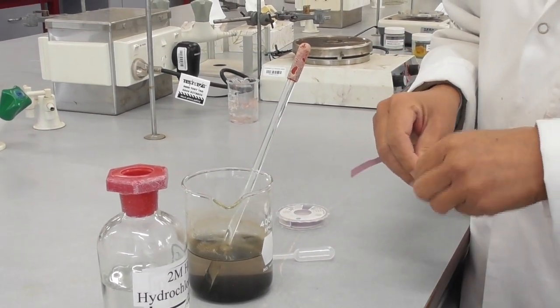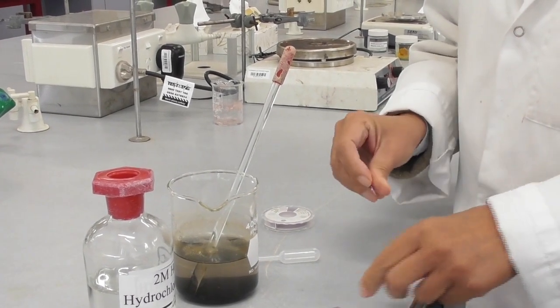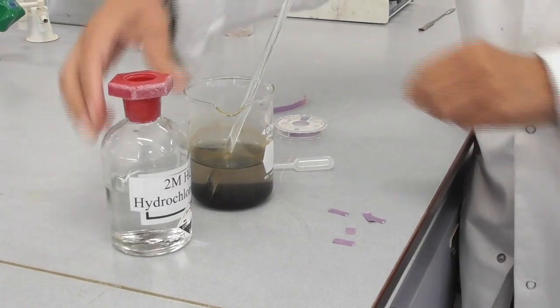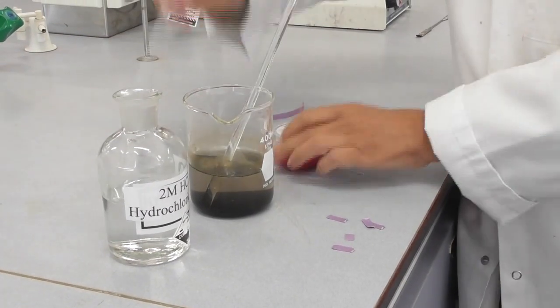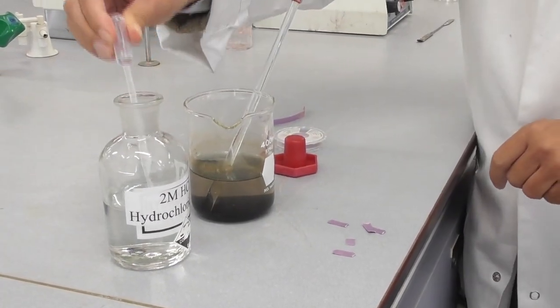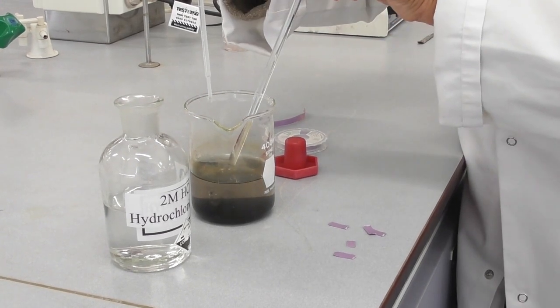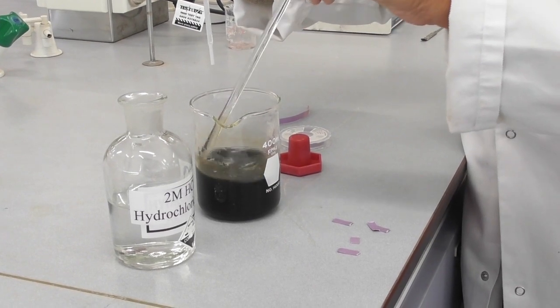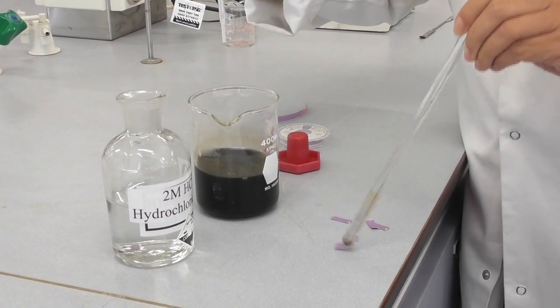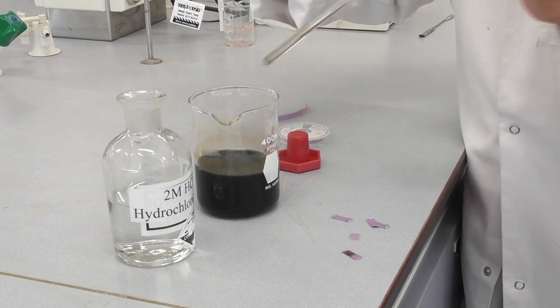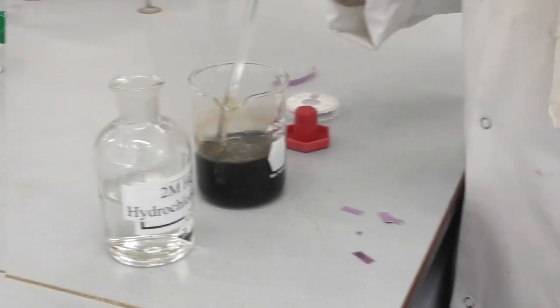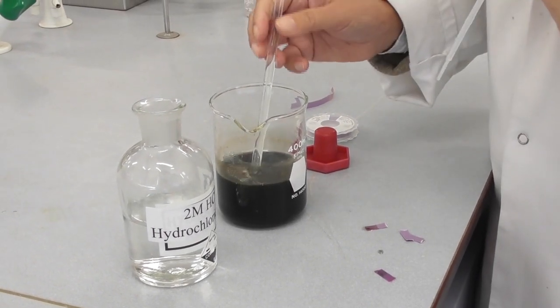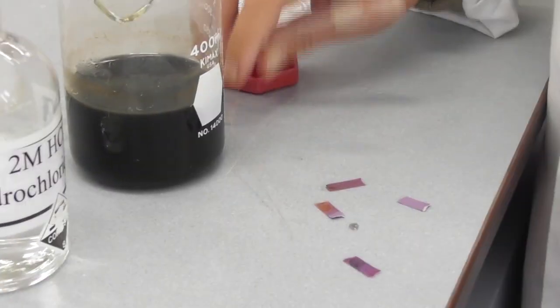The next step is to neutralize the solution with 2 molar hydrochloric acid. I prepare some strips of litmus paper and then I add a milliliter or two of the hydrochloric acid into my solution. I give it a good stir and check the pH with the litmus paper. If the litmus paper turns pink, then my solution is neutral or acidic. This might take a few tries.